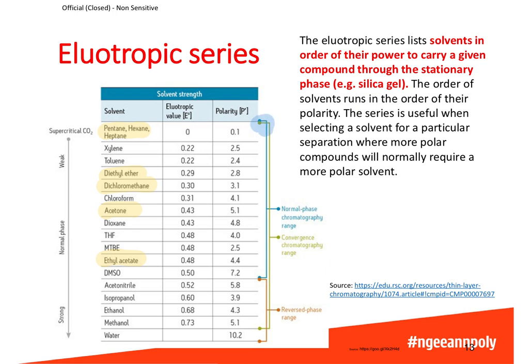The organic solvents in this range are usually used for normal phase chromatography, and TLC is usually carried out in normal phase, whereas the solvents that are more polar at the bottom of this list are usually used in reverse phase chromatography, which I will explain later on.